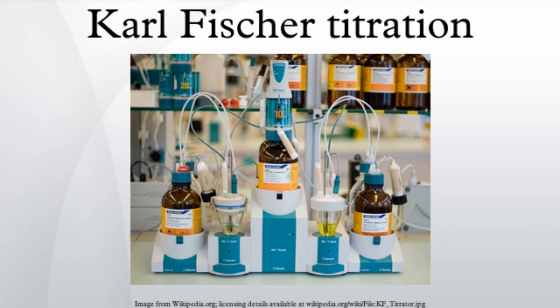References: Fischer, Karl. Verfahren zur maßanalytischen Bestimmung des Wassergehaltes von Flüssigkeiten. Angewandte Chemie 48, 394-396, doi:10.1002/ange.19350482605. Literature: Water Determination by Karl Fischer Titration by Peter A. Bruttel, Regina Schlink, Metrohm AG. See also: Titration, Moisture Analysis. External links: EMD Chemicals Aquastar Tech Notes.